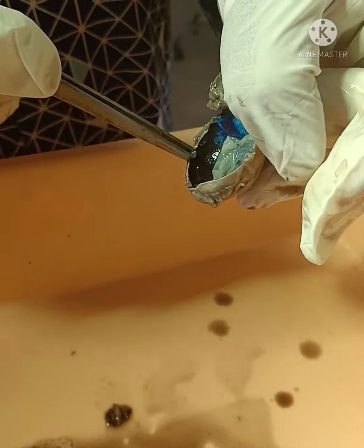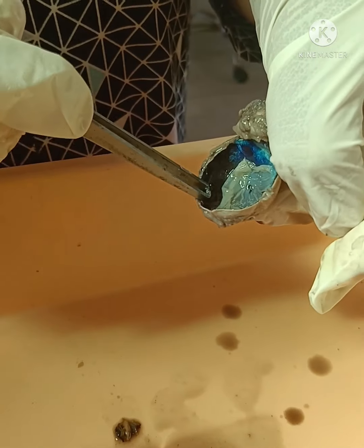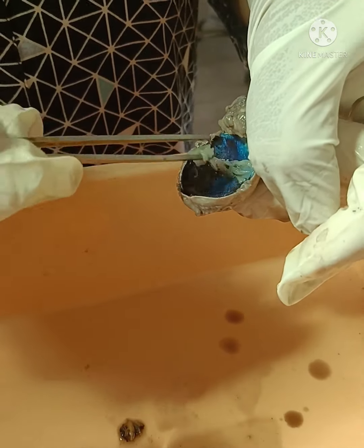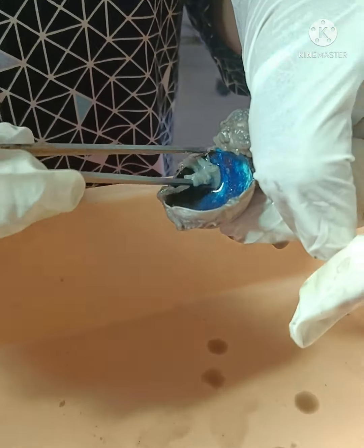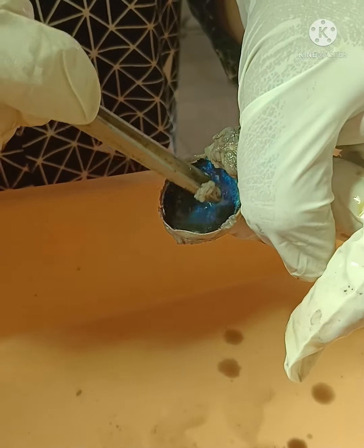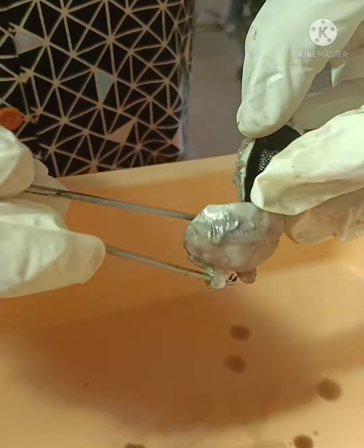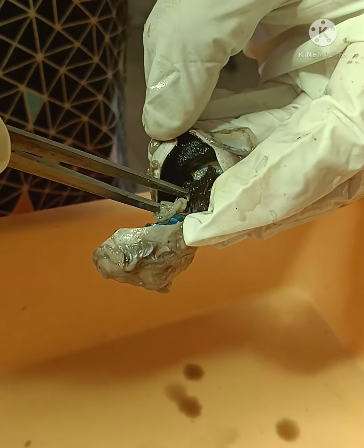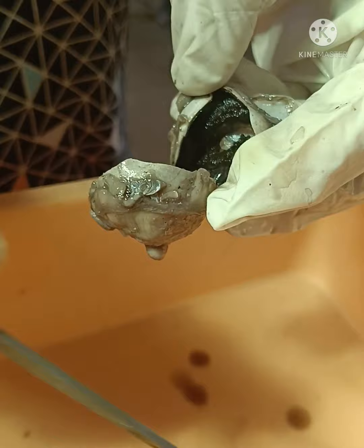Internally we can see that brownish layer. This brown pigment layer is known as the choroid. The choroid occupies the posterior portion, and because of the presence of pigment cells, it appears brown. Anterior to this choroid, the anterior segment has the ciliary body and iris. The anterior-most part is the iris.